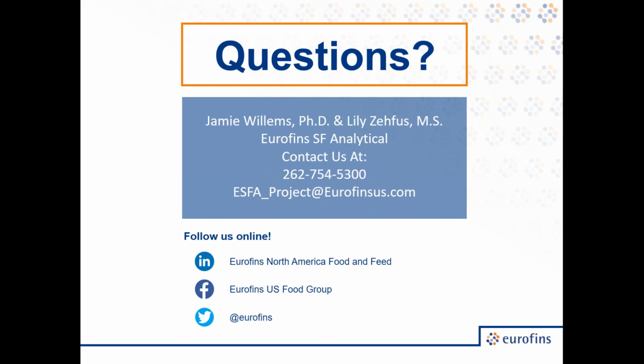All right, thank you. Our next question here is, are you able to perform analysis if you don't have a control sample? I can take that one. Yes, we can. It's not ideal, as you probably saw on a bunch of our slides.